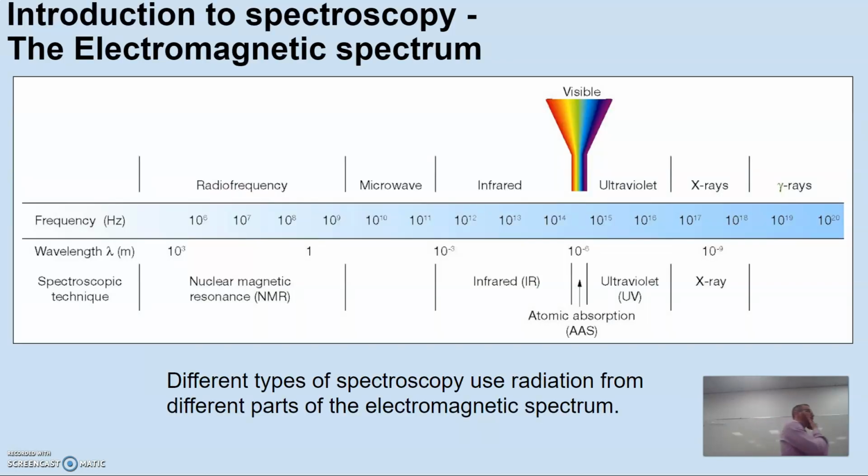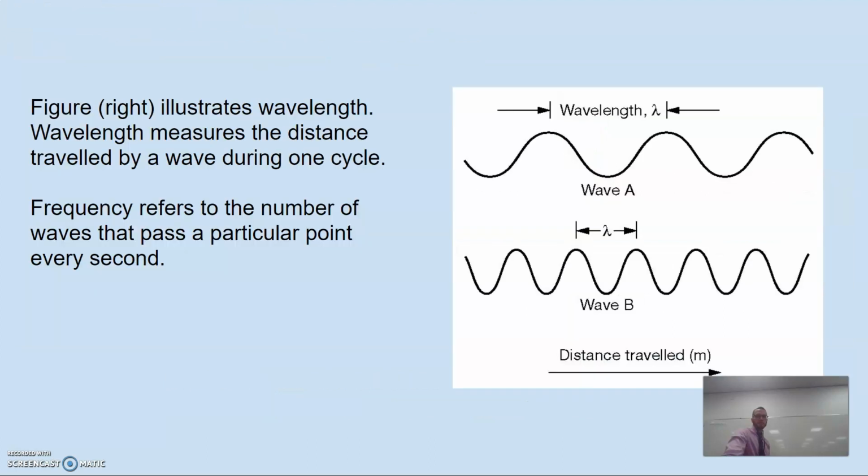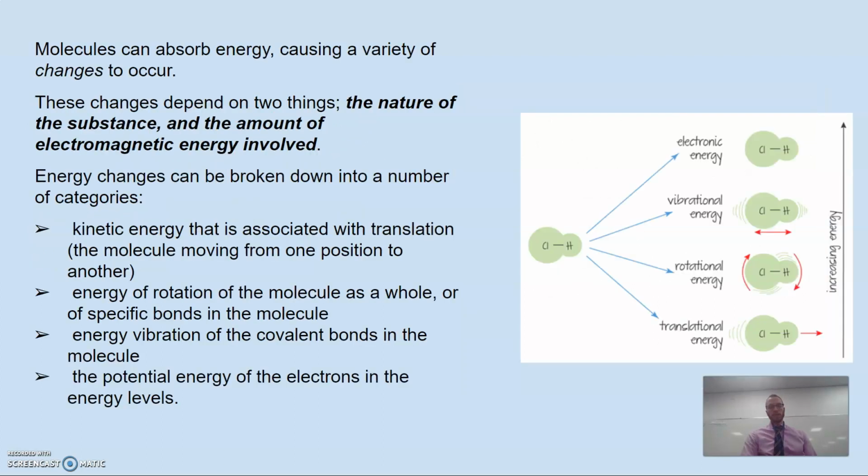So spectra refers to something to do with light or a spectrum or a graph, right? Scopic, think of that as scopic means to look at, I believe. So wavelength, versus we've got large wavelengths or short wavelengths. Don't have to worry too much about that.